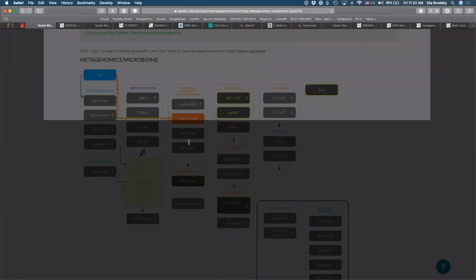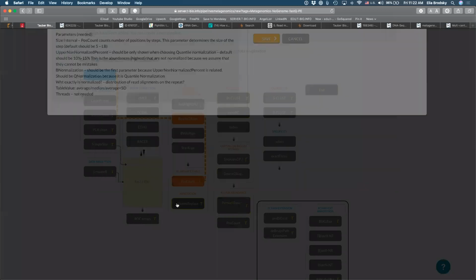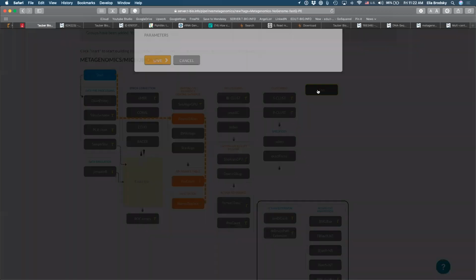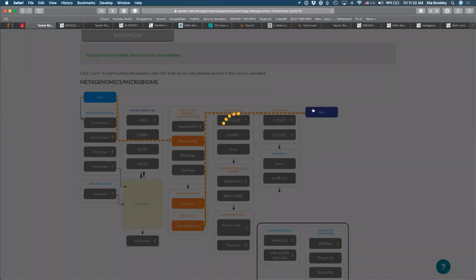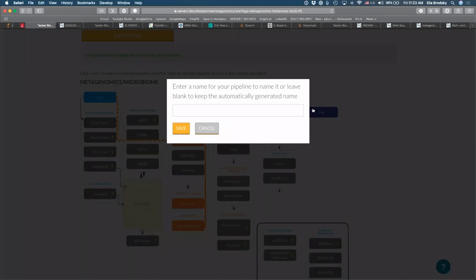So I'm just going to count and replace the names. Nothing really to change here, and okay, so again, you can now do the same for your data set.